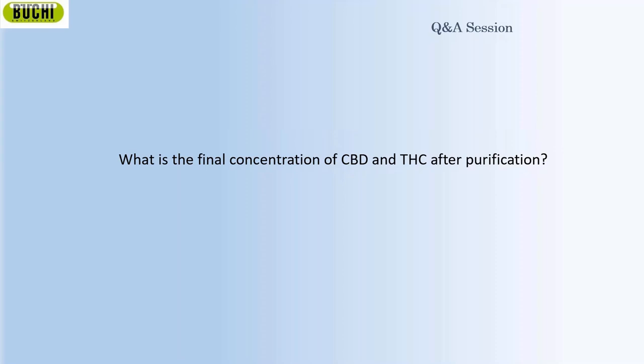Because I can tell you that with the proper method, you will isolate CBD only and THC only. And once you put these CBD and THC on your rotary evaporator, you will evaporate your solvent and water. The more you evaporate, the higher the concentration you will get.